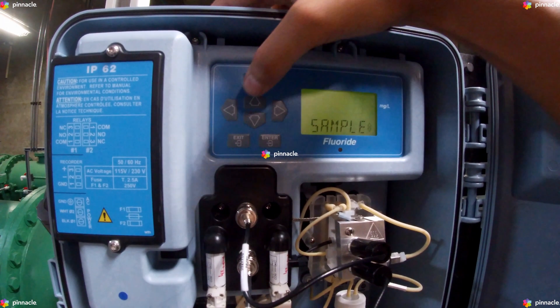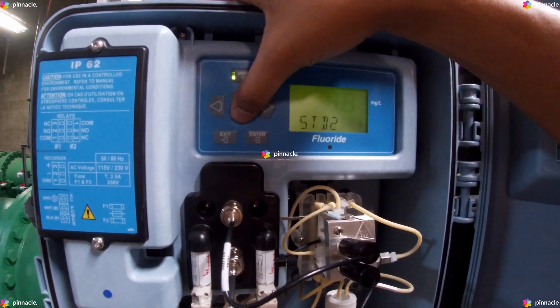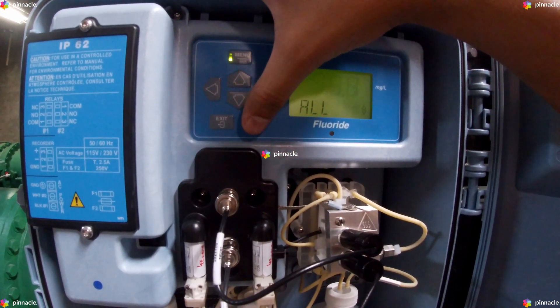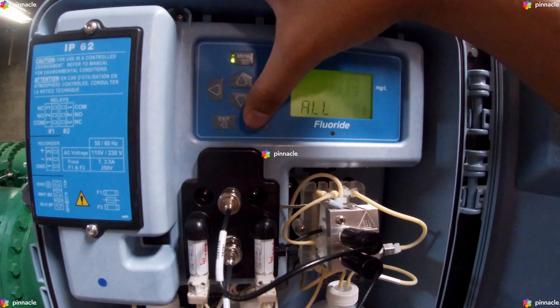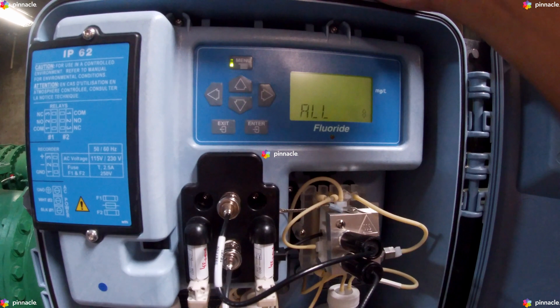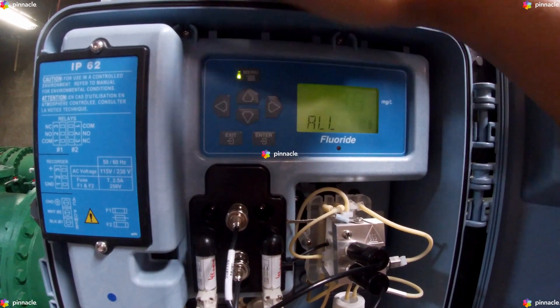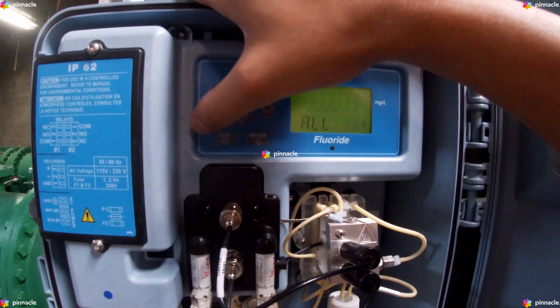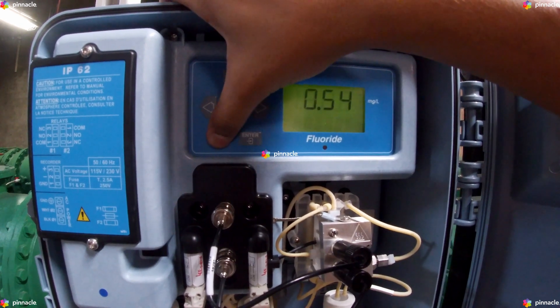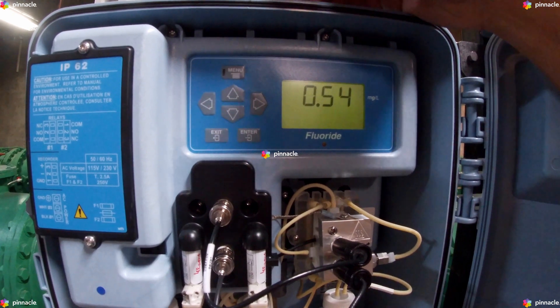We will click on the All option for this purpose. Once we click Enter, the system will begin to prime the standard one for 90 cycles, the standard two for 90 cycles, and 90 cycles for the reagent.